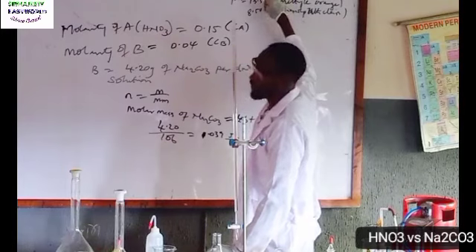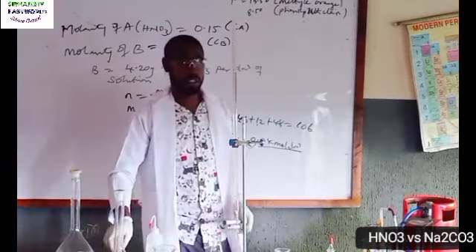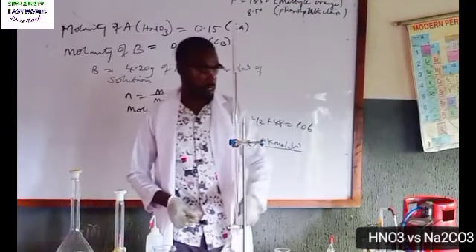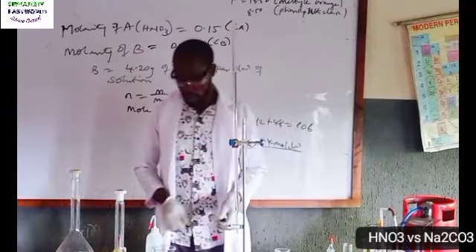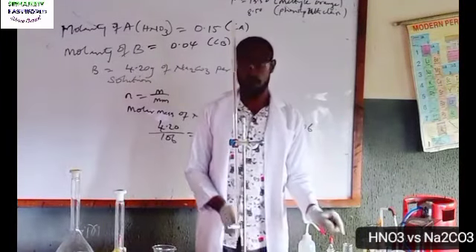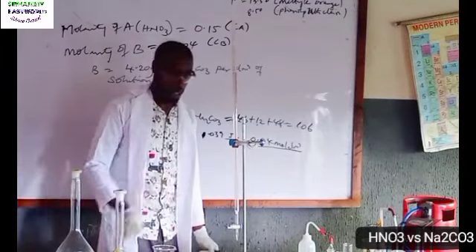I'm telling you that the first one, 13.5, should be the best. So methyl orange is the suitable indicator in this titration and not phenolphthalein. In trioxonitrate(V) acid titration, methyl orange should be the suitable one. Let me now do the calculation theoretically and see which of them is the correct one.